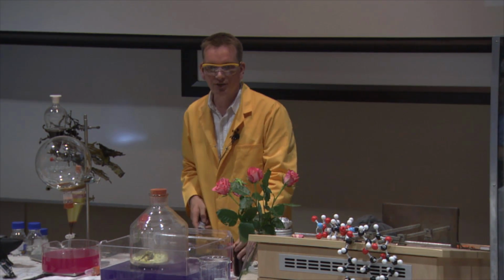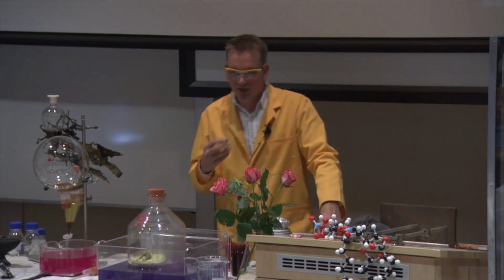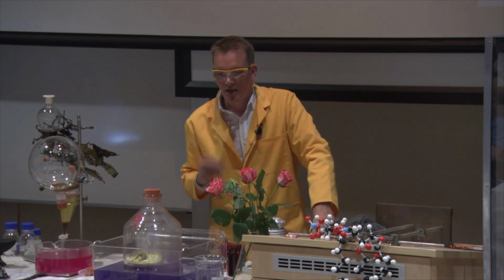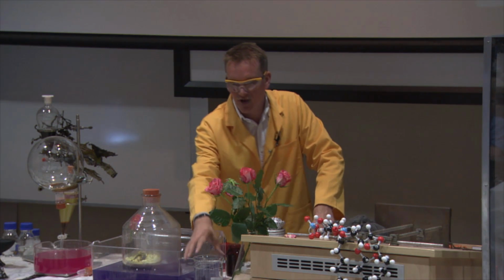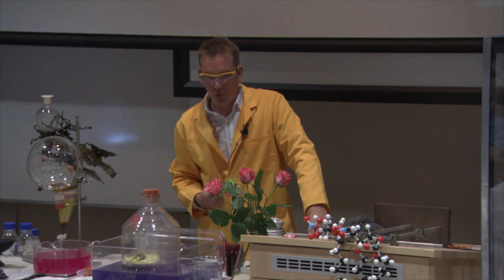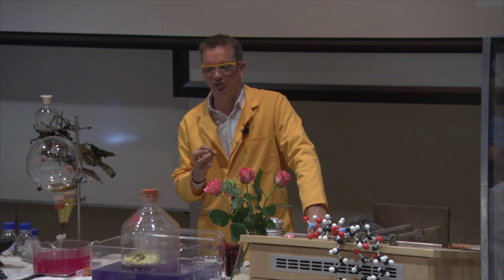And the chemical equation for this is the calcium reacts with the water and gives out bubbles. Now, this isn't carbon dioxide. There's no carbon in this. These bubbles are now hydrogen. The hydrogen's coming from the water, reacting with the calcium. So we're getting bubbles of hydrogen here, and we're getting, well, a white solution left, a white precipitate forming. That, again, is calcium hydroxide.